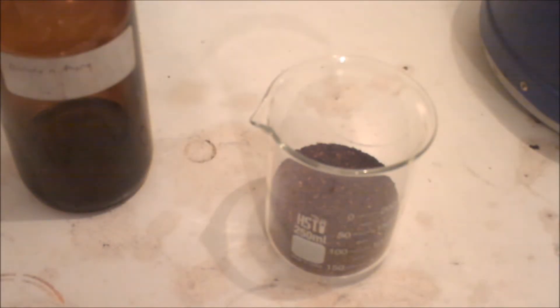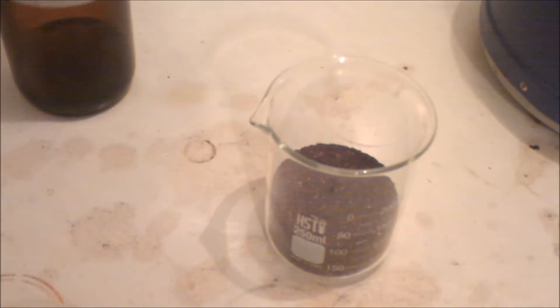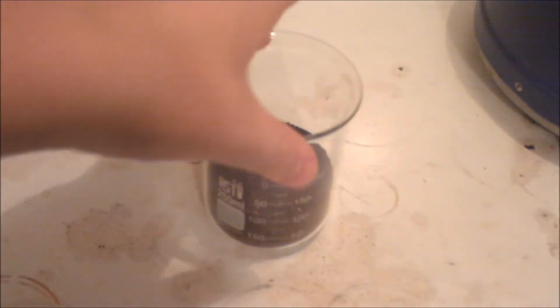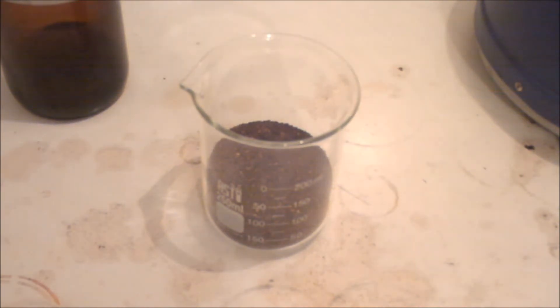Hi guys. Today we're going to be extracting caffeine. For this extraction, you're going to need a solvent to extract the caffeine, which is dichloromethane — that's what I'm going to use. The product containing the caffeine, which here I have 20 tea bags of black tea. They come in individual packages, so I got 20 in there. You're also going to need water and a vacuum filtration system or a regular filtration system — vacuum is just faster.